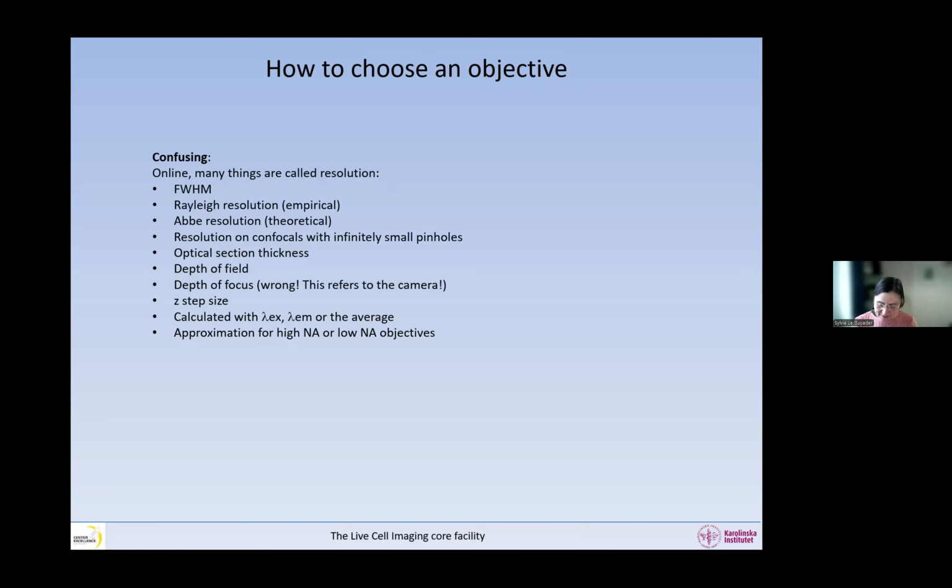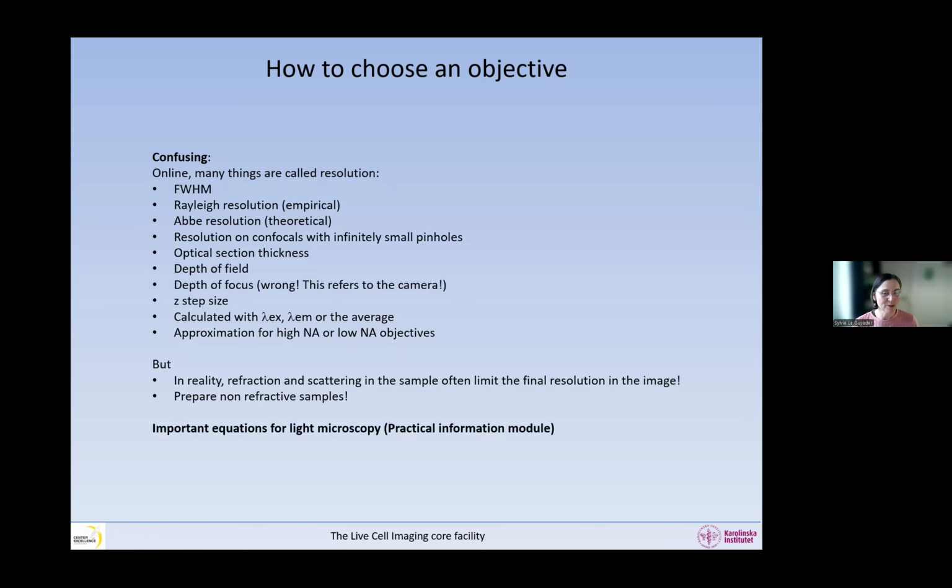So believe me, don't go online to look at it. If you miss the equation, go to this document and then we will talk the same language throughout the course. After the course, you can pick the equation you want. So in reality, also the refraction and the scattering in the sample is often what limits the resolution. So please prepare non-refractive samples, and we will talk about sample preparation on Tuesday. So go back to this document when you need.